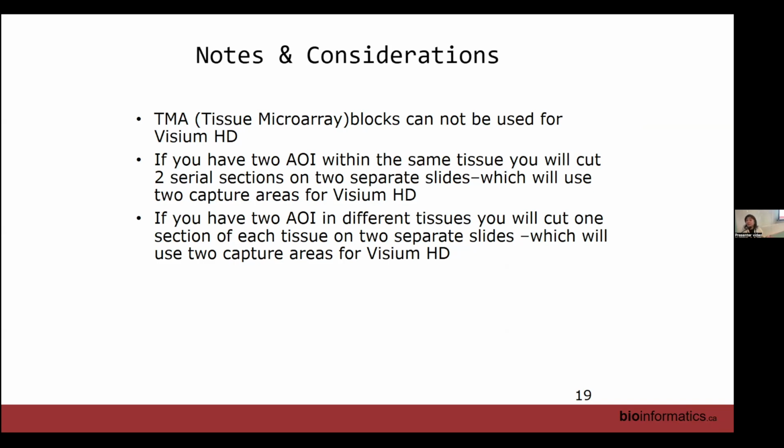All right, any questions on the paraffin embedding or paraffin wax block type for Visium? I'm going to move on to frozen after.